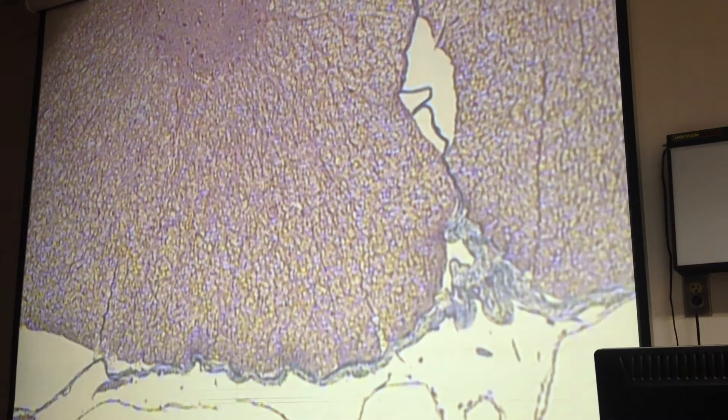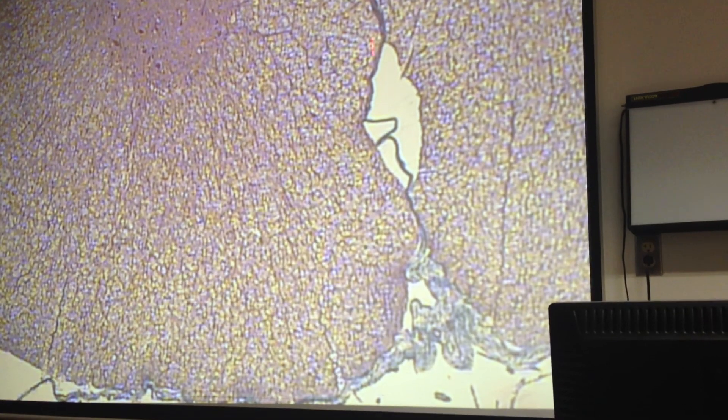Okay, what looks like more of a space or groove? A fissure. Yeah, this one here. So this must be the anterior side because here's the fissure. It's a little separated part right there. It happens when you section, things sometimes fall apart.